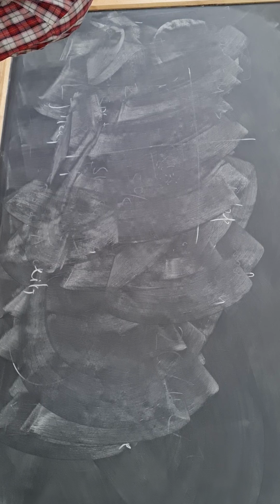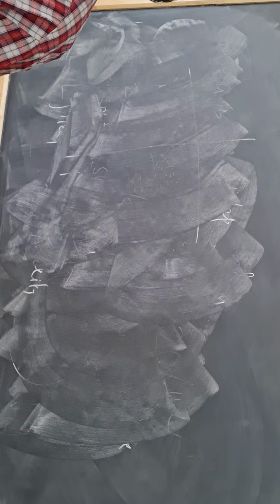Gram staining procedure, repeat with me. Cover the smear with gentian violet. Any violet can be used; most commonly we use gentian violet, methyl violet, crystal violet. Cover the smear for 1 to 2 minutes. Wash, blot dry. Add Gram's iodine for 30 seconds to 1 minute. Wash, blot dry. Decolorize with acetone or alcohol until a faint color remains.